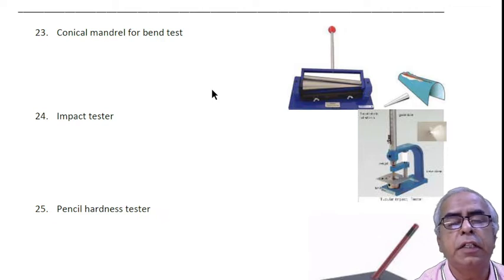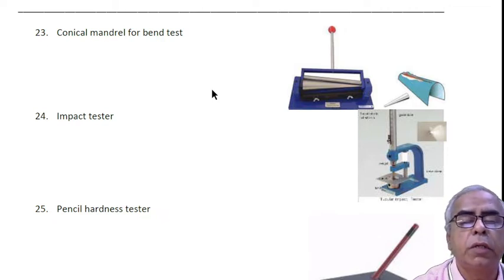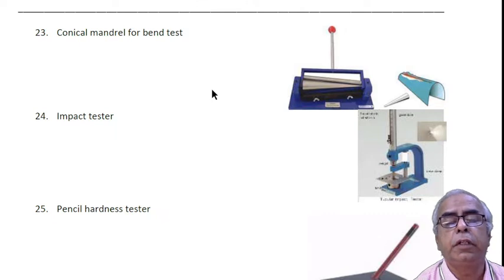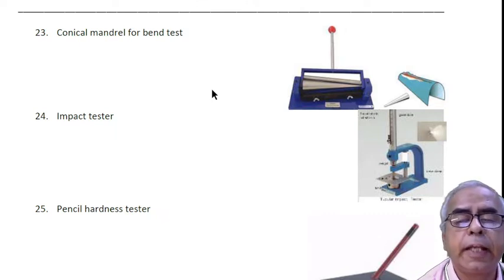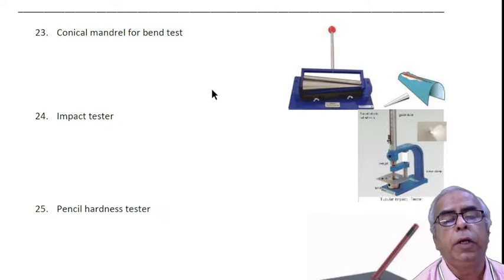By applying paint on the panel and after drying, we can insert it inside the cone. When we press this, we are able to bend the panel. What we expect is there should not be any tearing of the paint film. This is called bend test.